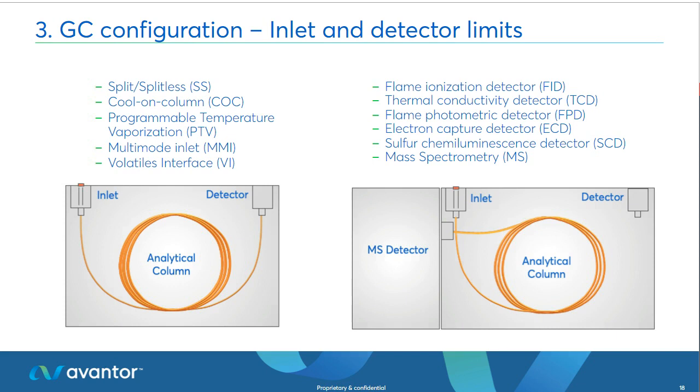But if you wanted to run at really low temperatures and keep the sample very cool when it's introduced into the inlet, you're not going to be able to do this with a splitless inlet because it doesn't have the cooling capabilities. The MMI and the PTV do have cryo cooling and cooling mechanisms. So this is where it restricts you a little in your method, and you need to make sure you're looking at the right applications that fit your inlet configuration.